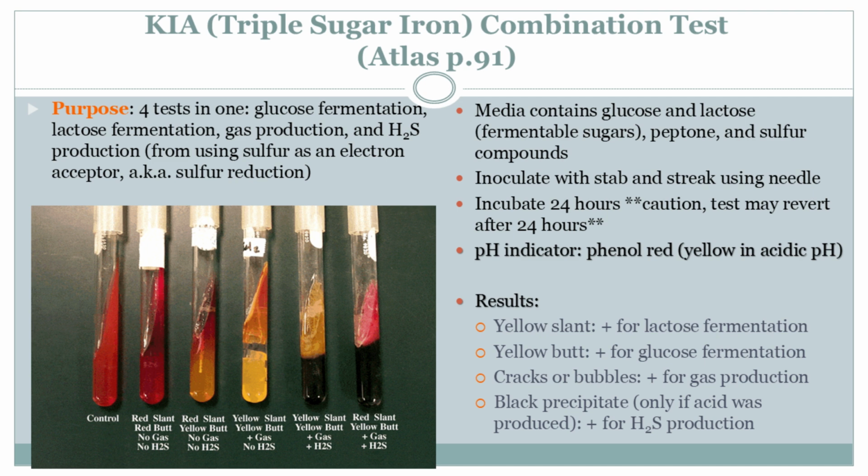Fascinating. Okay, so the colors give us a good sense of what these bacteria are snacking on. But what about those cracks and bubbles you mentioned? What's the deal with those? Those, my friend, are signs of a real gas-producing party.